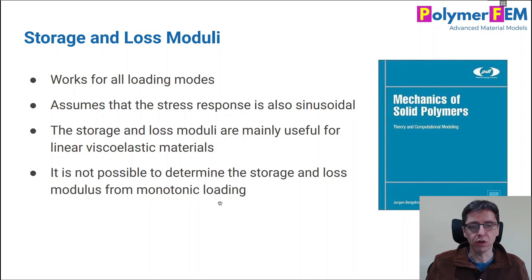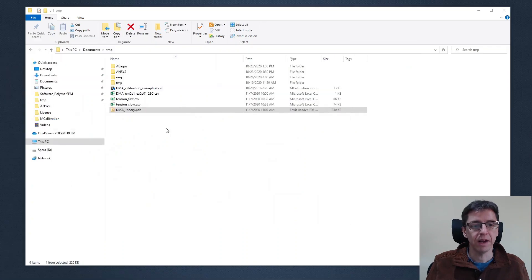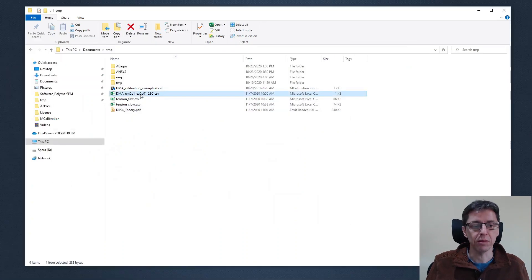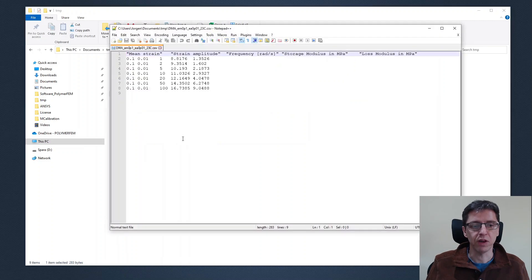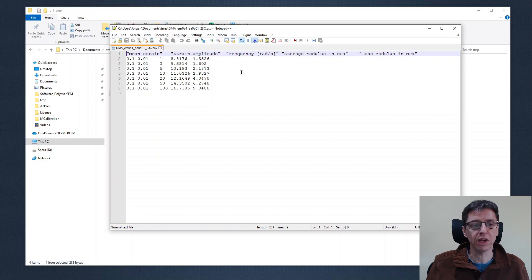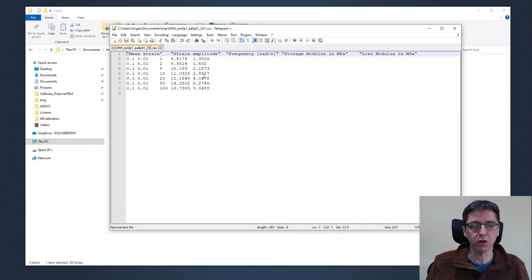So now let's assume that we have some experimental data that we want to analyze. So here in my case I have a data file that I want to work with. I open this file with a text editor, we see a number of columns of data here with the mean strain, we have the strain amplitude, and then we have the frequency in radians per second, we have the storage modulus and the loss modulus. So five columns here.